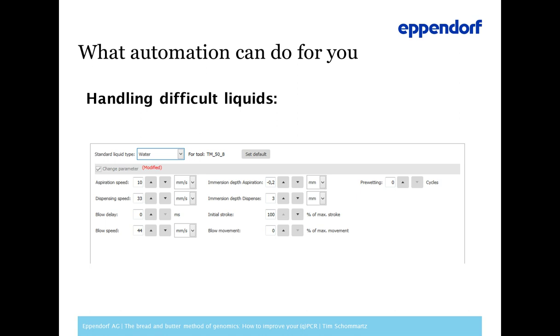Okay, that's actually something which I explained in the other advertised webinar. In principle, the automated normalization works similar to what you would do manually. So you have, let's say, a certain number of samples, and you have a diluent. And then you put the diluent and the samples together in a way that you end up with a plate where you have all of your samples having the exact same concentration.